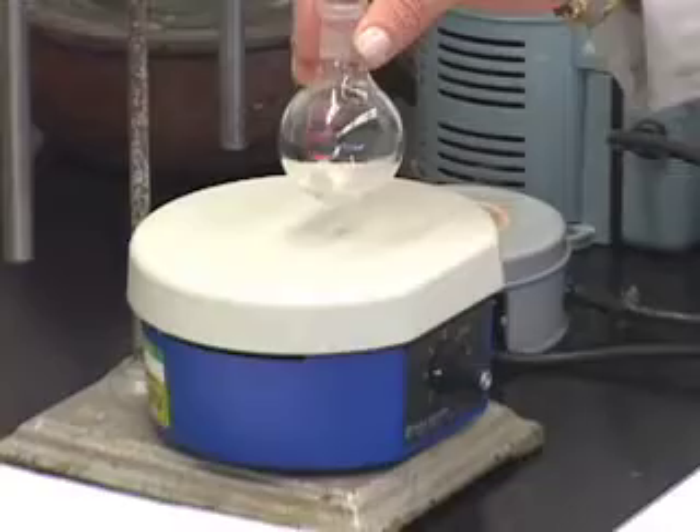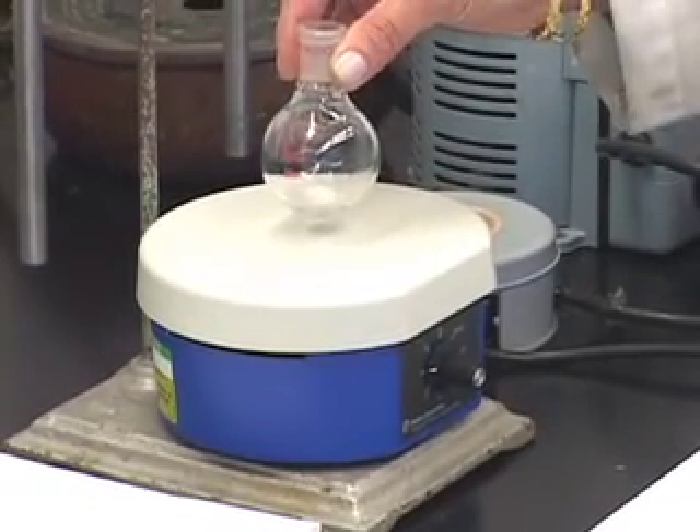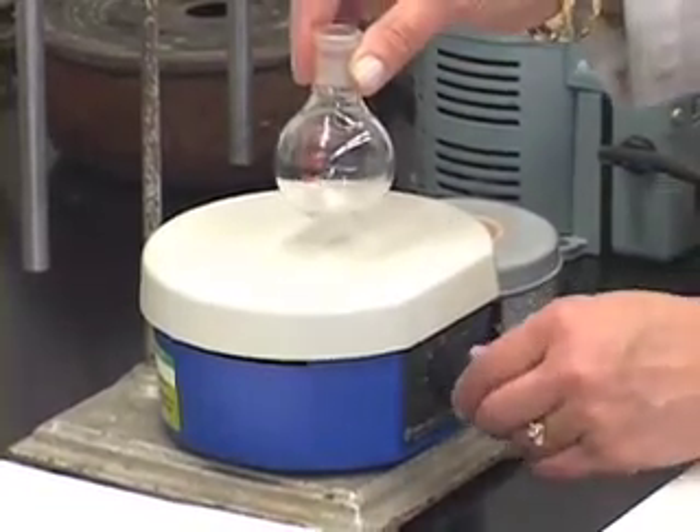So this is a magnetic stirring machine. We have the stir bar in here. Of course I am going to clamp the flask, but I just want to show you how the stirrer and the magnetic stir bar work together. Let us turn this off.